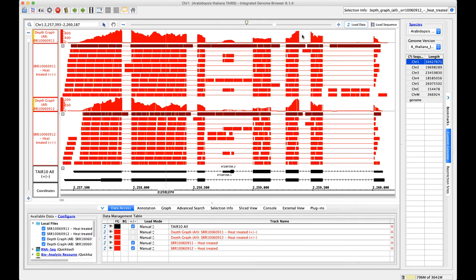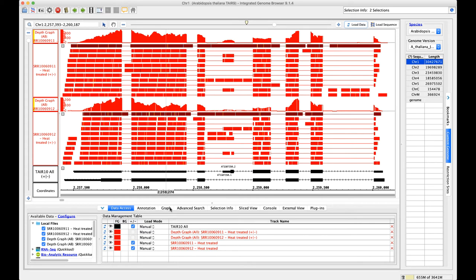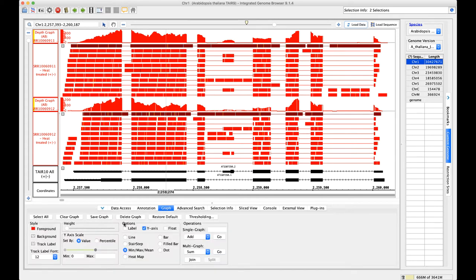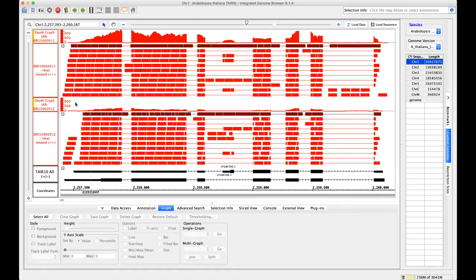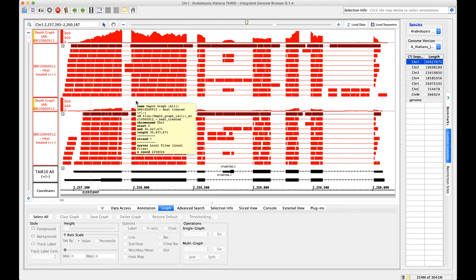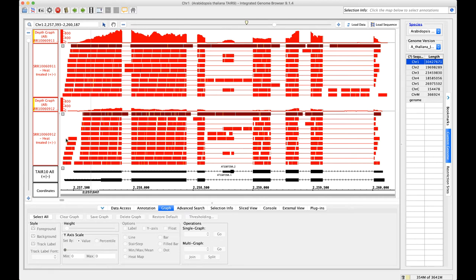IGBE will optimize how these graphs appear. Right now they look exactly the same. But you might notice that the y-axis for these graphs is actually quite different. You can put these on the same y-axis by shift-clicking. I'm on a Mac, and then in the graph tab down here at the bottom, I'm going to change the y-axis scale. If I just grab this and move it, it'll put them on the same scale. Now you can see they're both on the same scale. And indeed, our 912 file has fewer reads over our gene of interest.